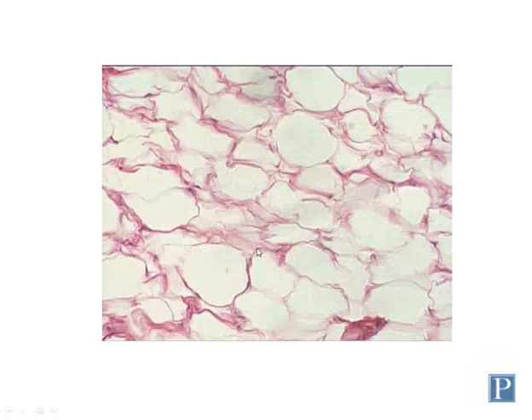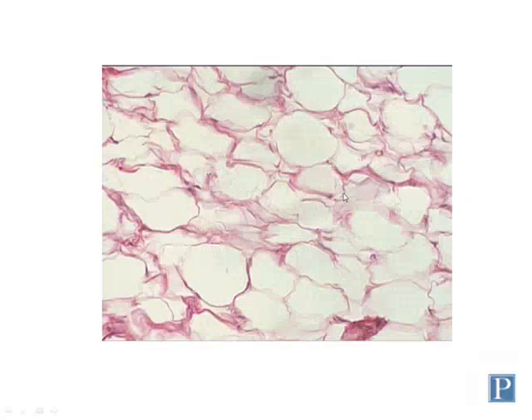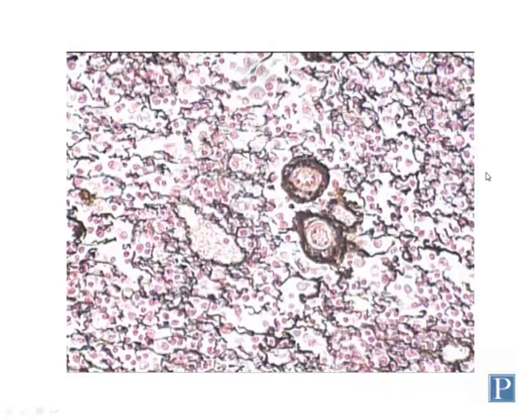Histology is often more of an art than a science, and so in this case the integrity of the cell membranes has been compromised somewhat, so it's oftentimes tough to see all of the cellular structure here. Some of the cells have kind of degraded or collapsed on each other, but you can see lots of collagen fibers here in the matrix. So whether your slide looks like this or this really is going to depend on your particular slide.